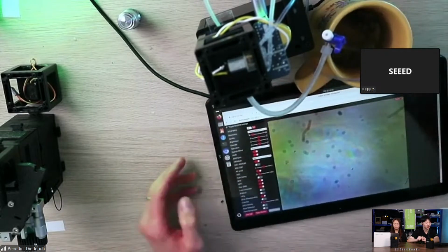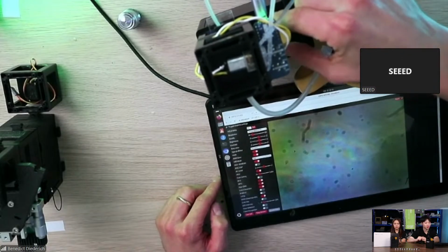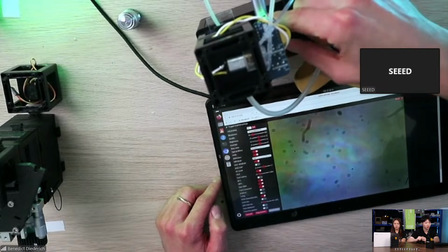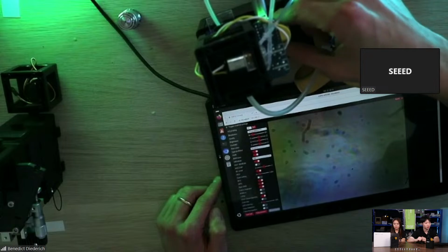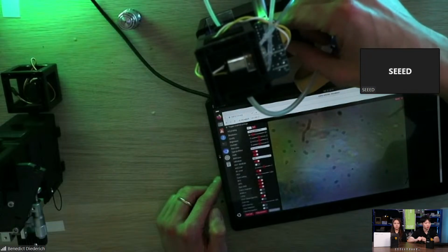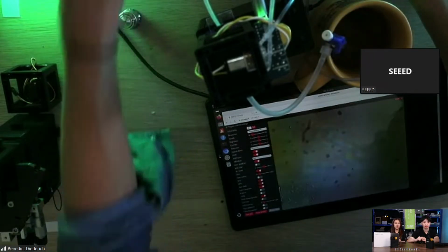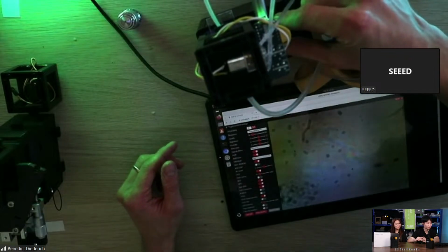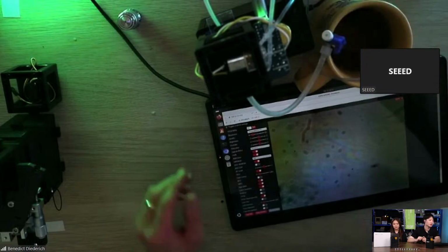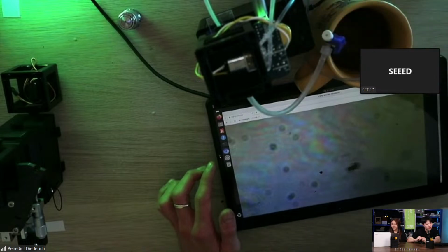What you see now is essentially the live stream again from the Xiao microscope, and we have to focus on the channel, and you see already some shadows going back and forth, and that's some of the particles from the pond. I think here somewhere. There we go, somewhere. So now we stop the pump. There's something we have trapped now. There's, again, probably some algae. Not so sure whether you can actually see that. It's a very tiny particle, so not so impressive here.